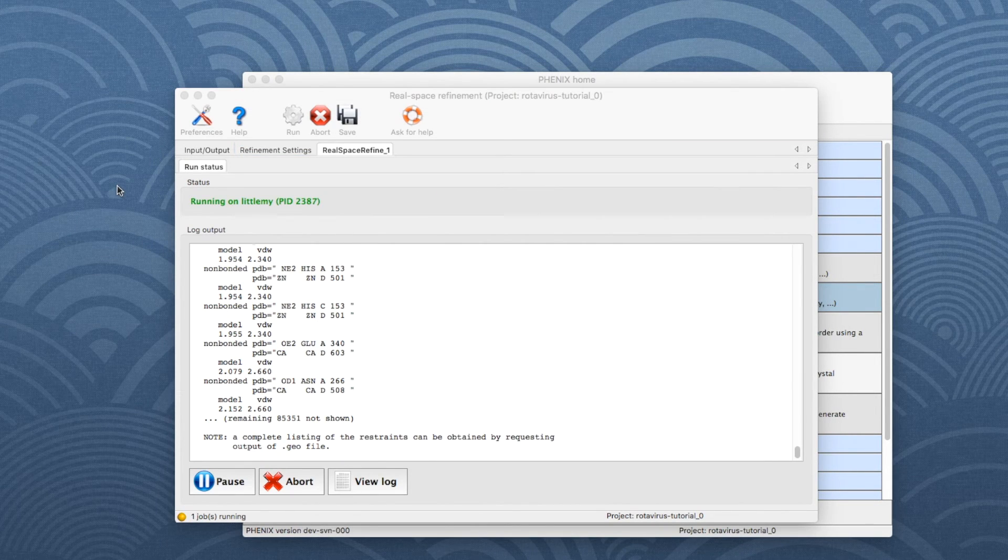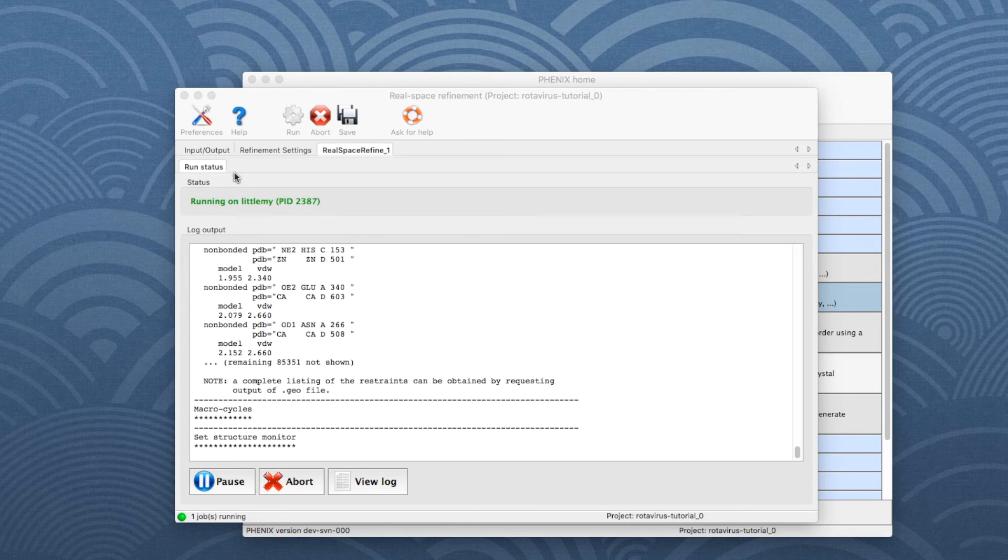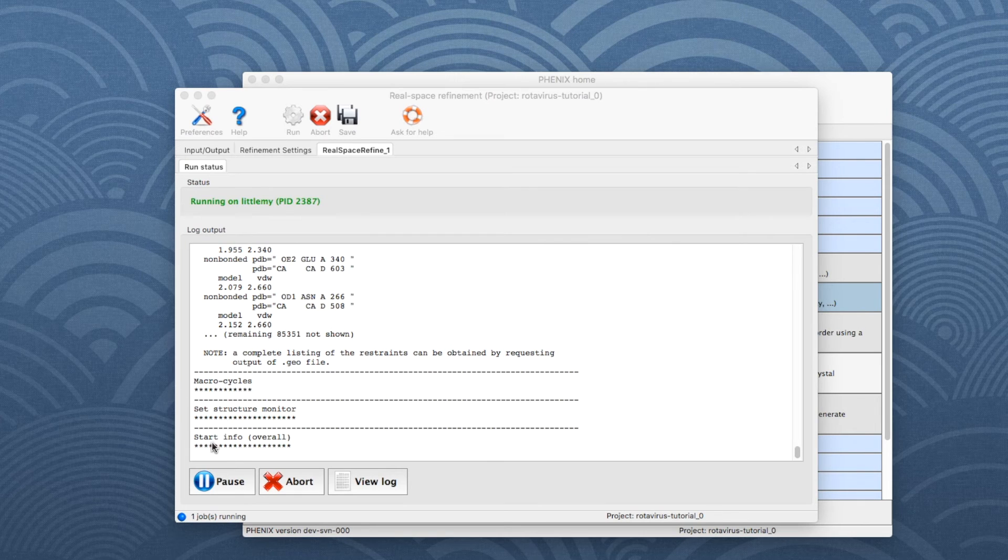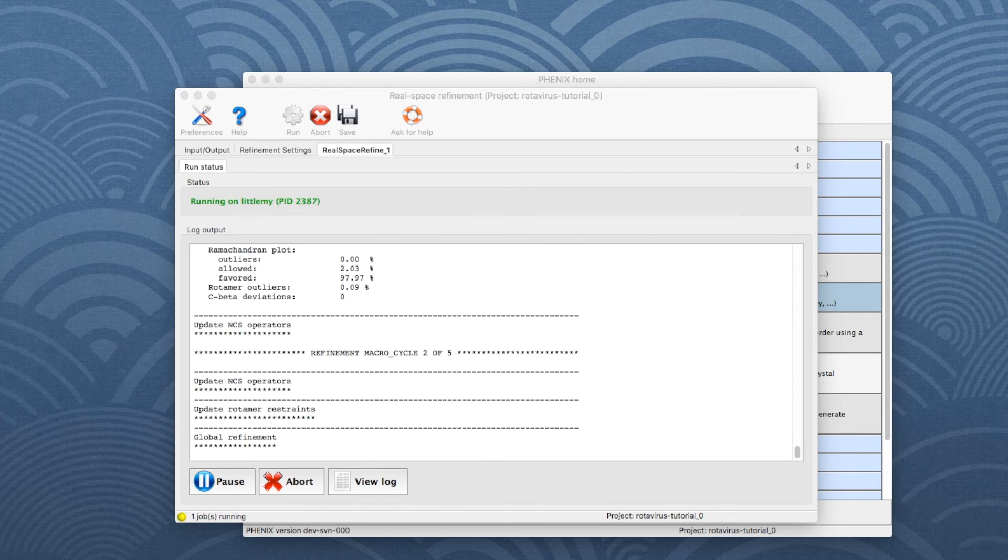After starting the refinement job, the tab Run Status appears. Here is the log file which is constantly updated and shows the status of the refinement.